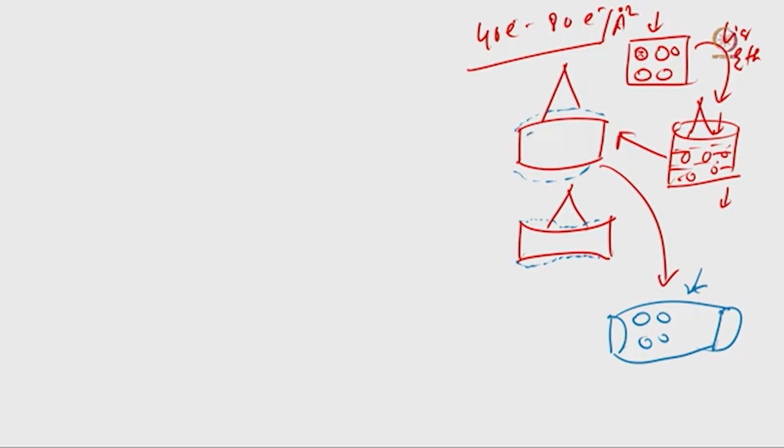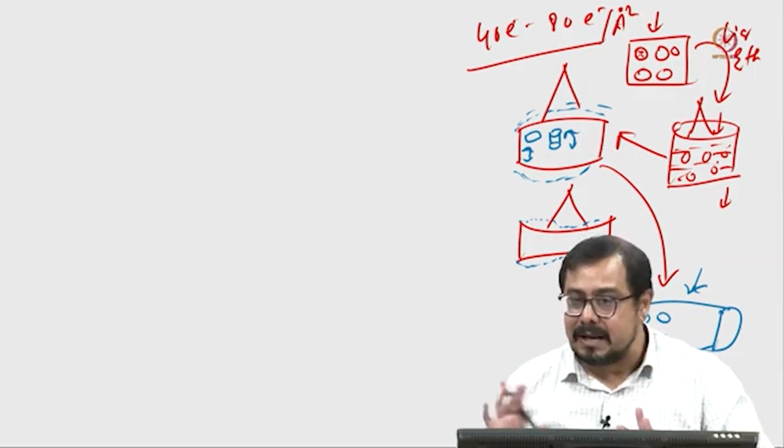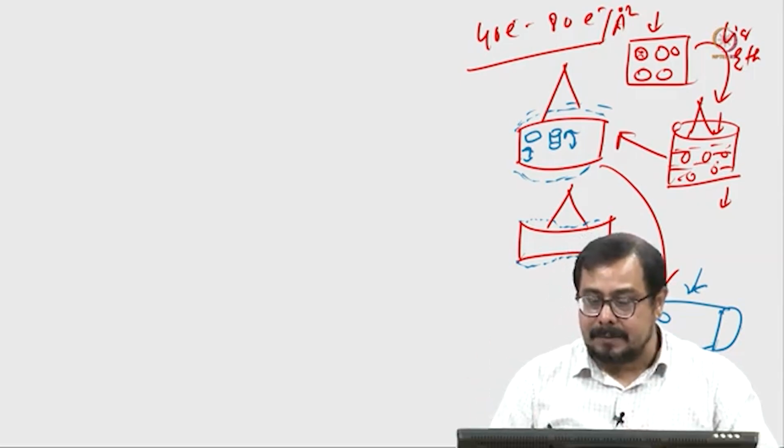So if some sample is fixed in this orientation and another is fixed in this orientation, because of this morphological change of the ice, there will be a rotation of these particles, there will be a movement of these particles. So we cannot capture the actual position of this protein sample or DNA sample or DNA-protein sample.